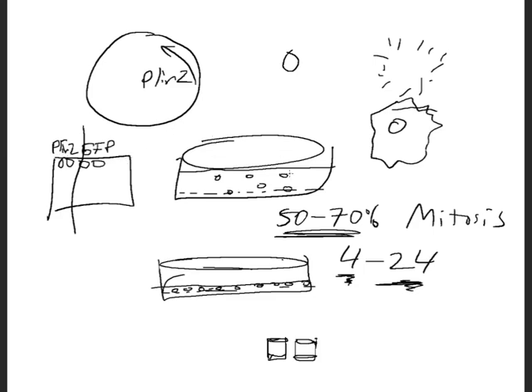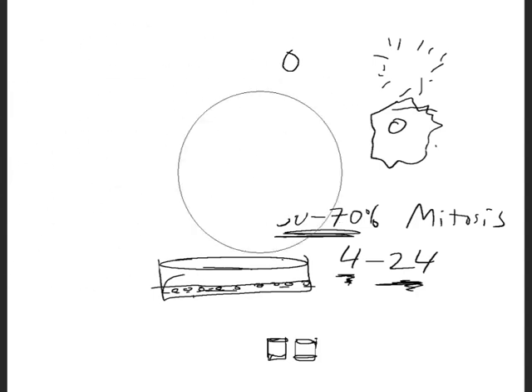So the first part of this lab was the transfection. Basically, we would have done the transfection on Wednesday, and we would have just let them grow till the following week. The following week, I would have basically given you a lecture, as I'm about to do now, on differentiation. And then we were going to make observations on those cells, and I'm going to give you data on Canvas under Files showing you what the cells would have looked like at that point.